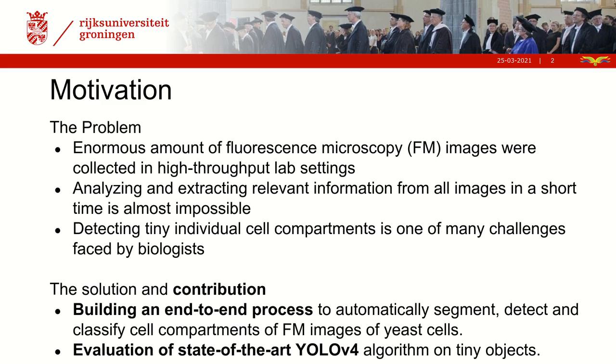So let's start by defining the problem. Modern microscopy allows the production of big amount of cell sample images in a short time. The large datasets help biologists in studying complex aspects. The challenge, however, is to process the data, extract information, and to identify clinically relevant diseases in a short time. Manual processing might lead to error or fatigue. Hence, integrating techniques from the deep learning field seems to be a promising solution for this problem.